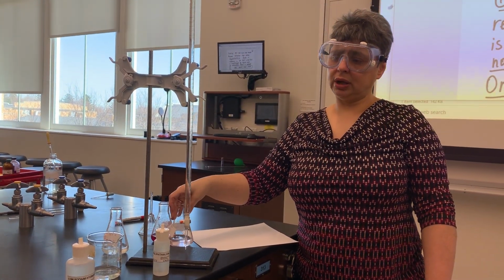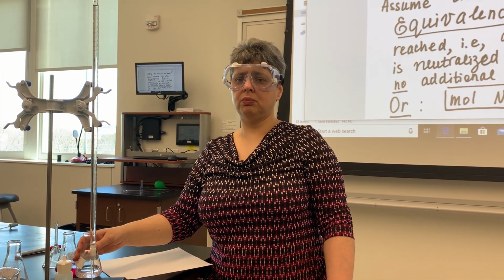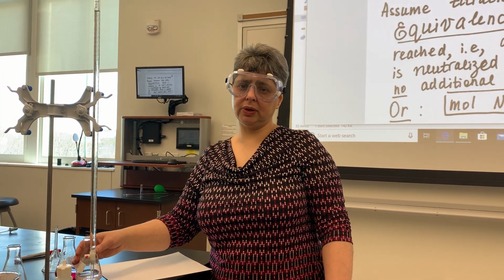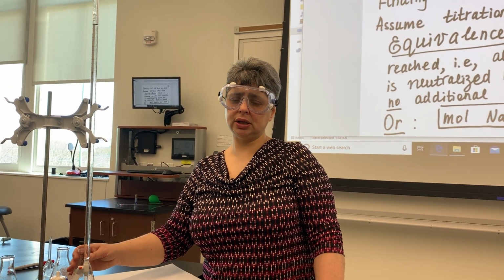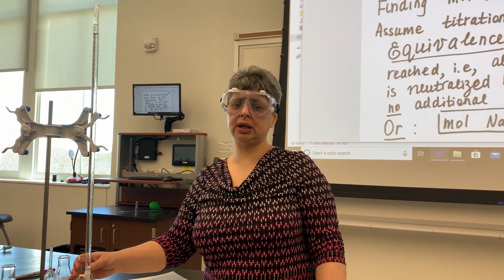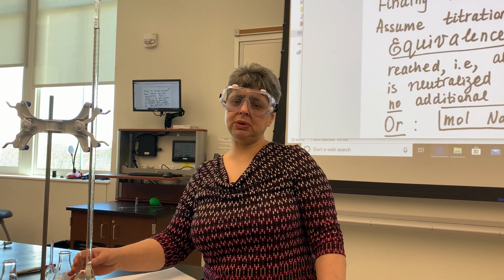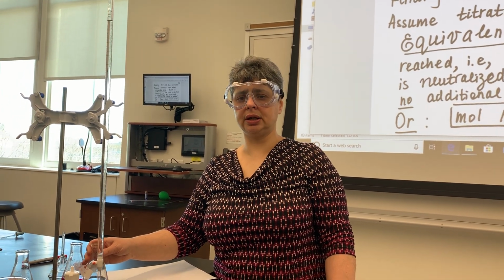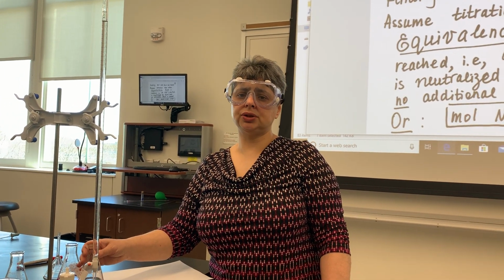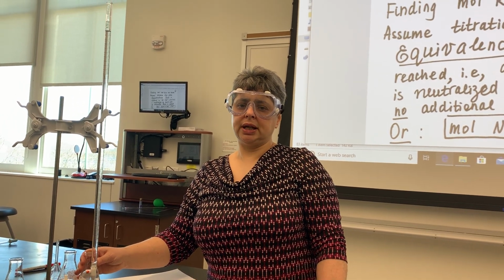Then you will have to calculate moles of KHP, and based on that, the moles and exact molarity of sodium hydroxide. I'd like to add that the molarity of sodium hydroxide that you calculate must have 4 digits after the decimal. This usually means that the solution of base would be considered standard, meaning its concentration is known exactly. All right, everybody, till next time.